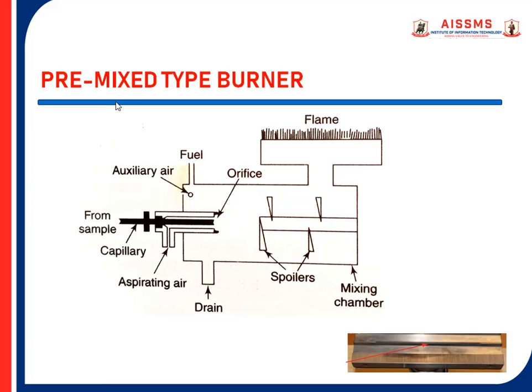Premix type of burner. The fuel and support gases are mixed in a chamber before they enter the burner head where they combust. The sample solution is aspirated through a capillary by the Venturi effect, using the support gas for the aspiration.